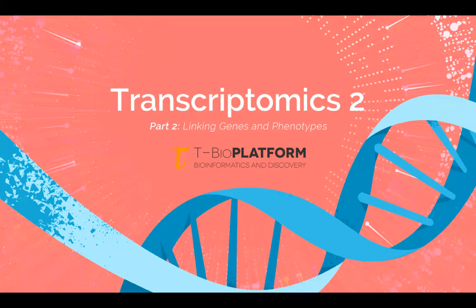Transcriptomics 2 builds upon transcriptomics 1, where we learned about processing of high throughput sequencing data. So here we will be introducing you to the t-test, its history, the nuts and bolts of the formula, and give you some examples of how statistics can be used for differential expression data.